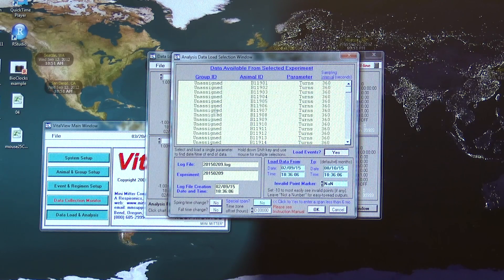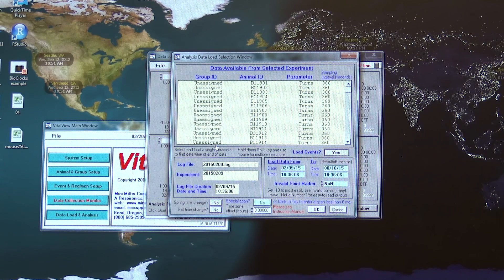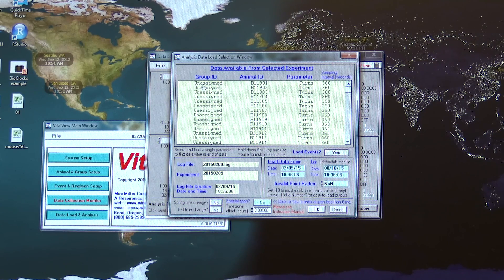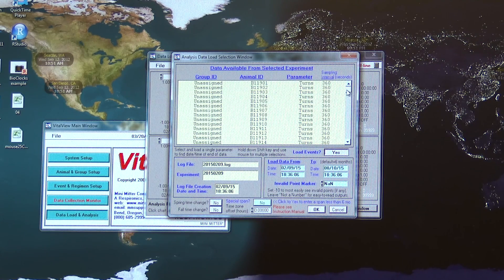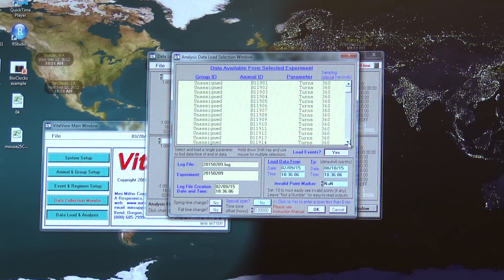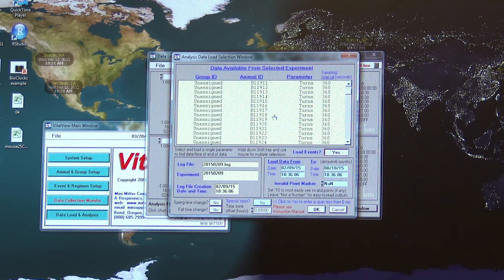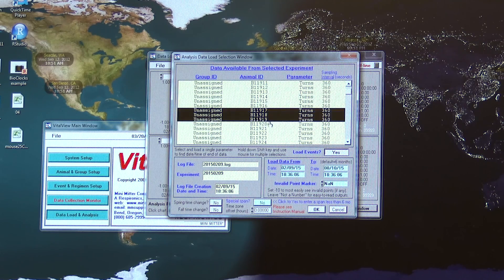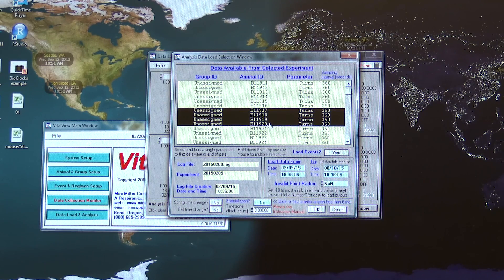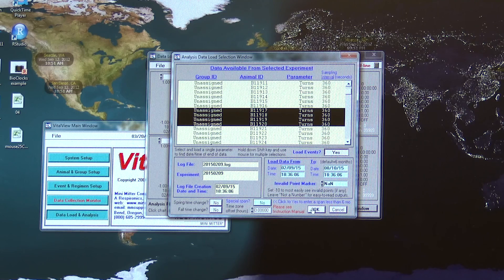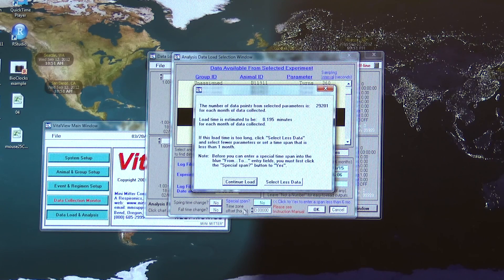Now this is going to show me all of the channels in all of our chambers. Basically each one of these lines is an animal, so this is all of the experiments being run at this time. From this I'll choose the channels that I'm interested in, select them, and then click OK.